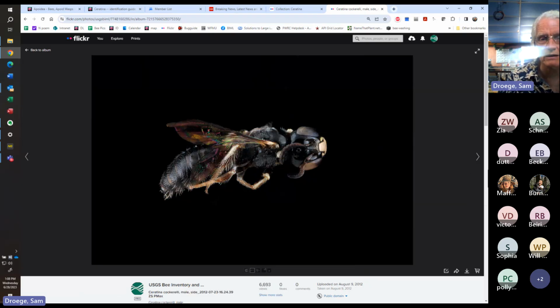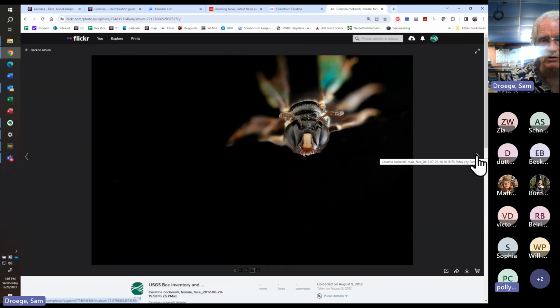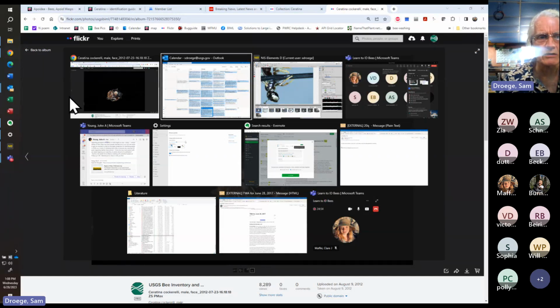The vibe is just really different. That's a male. You can see the two white marks that are expanding, and that the clypeus is basically all white, and the two white marks are in the paraocular areas too. So female again, just a very shiny little tiny beast. So to be specific, that was the male at the last shot. So we go back to the guide.